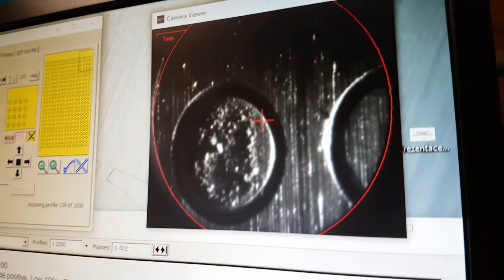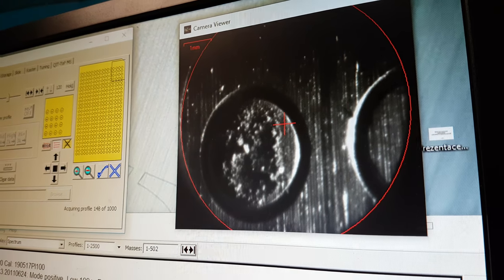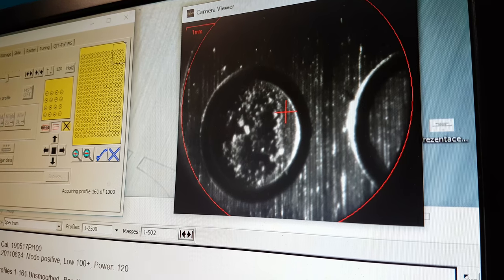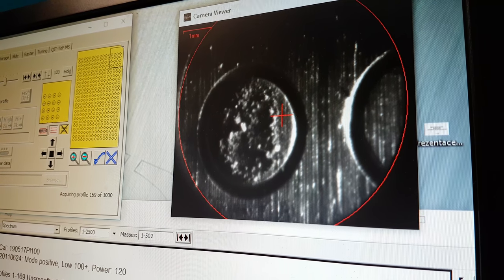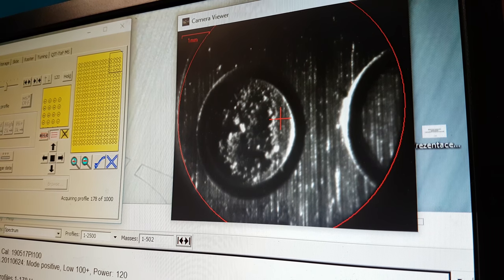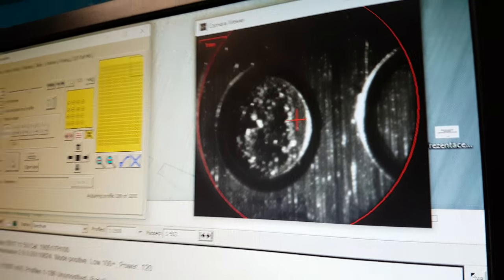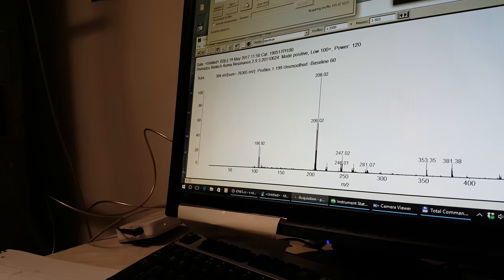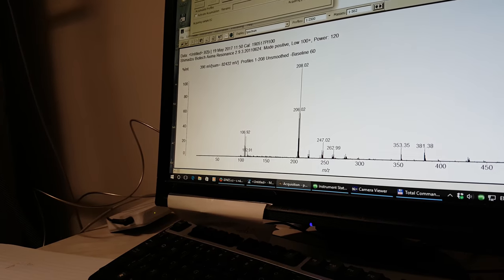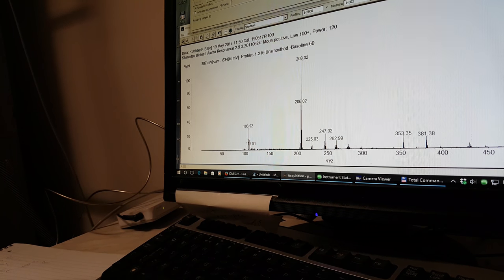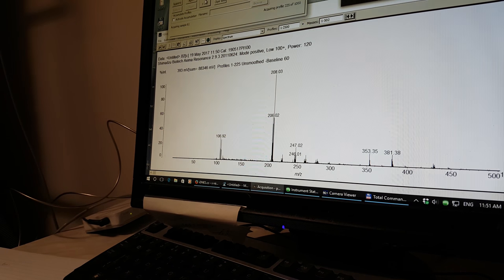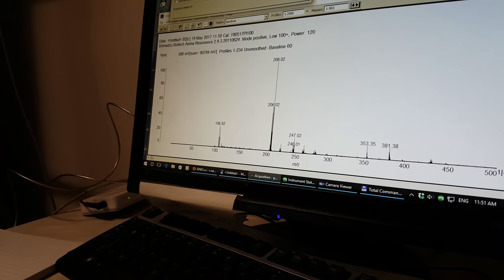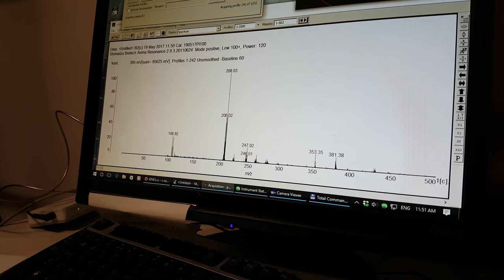The threshold of intensity is 5,000. At 400 it's good, but we can also try using high energy and we will obtain better results. The machine is a Shimadzu Axima Resonance. I can send that information.